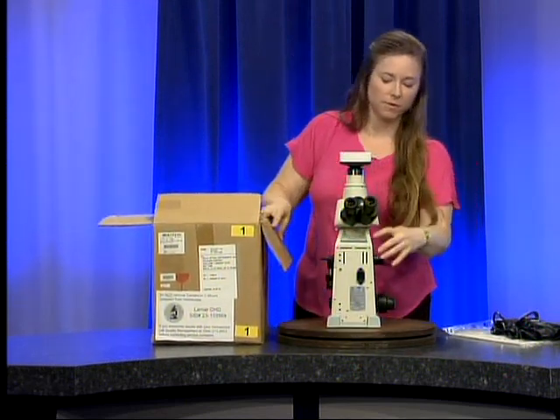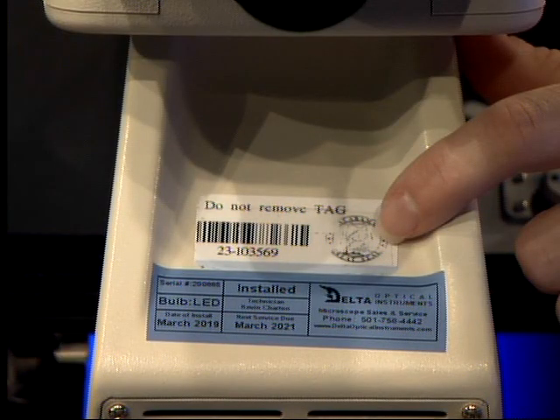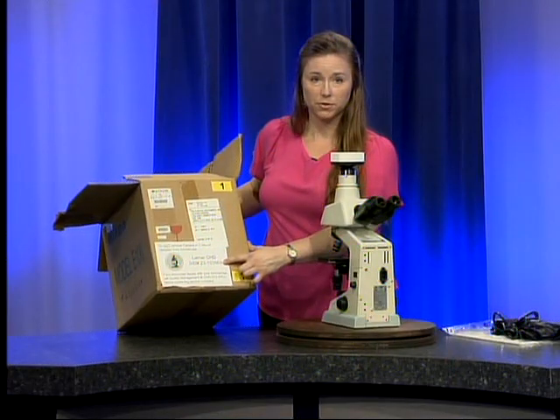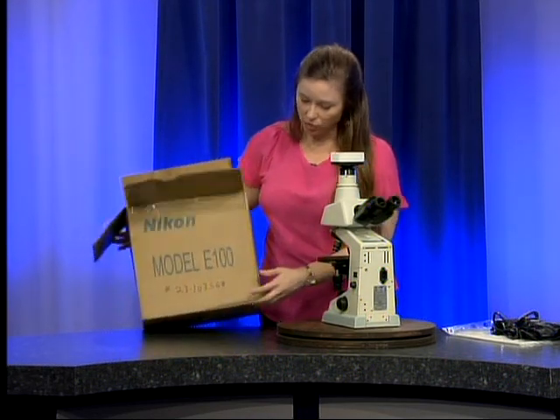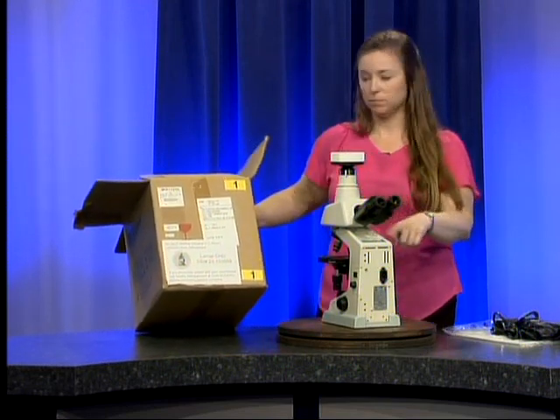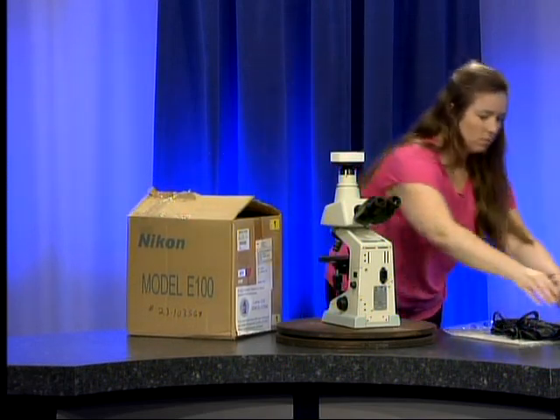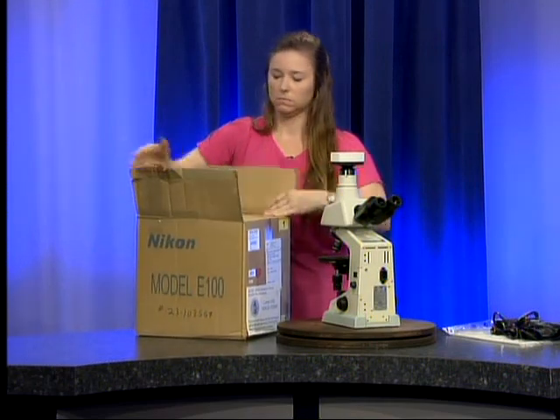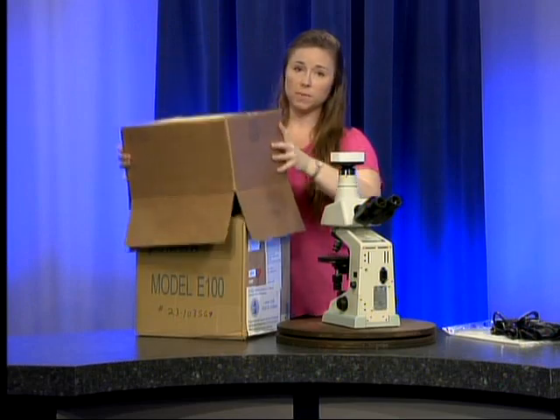Right here under the oculars — the eyepieces — you will find the state property tag of your microscope. Before you put your box away, compare that number to the number on the front of your white label. It should also be written on the side of the box. Make sure those match, and if they do not please let us know. All right, I'm going to put this away now — remember we're keeping these boxes for storage.